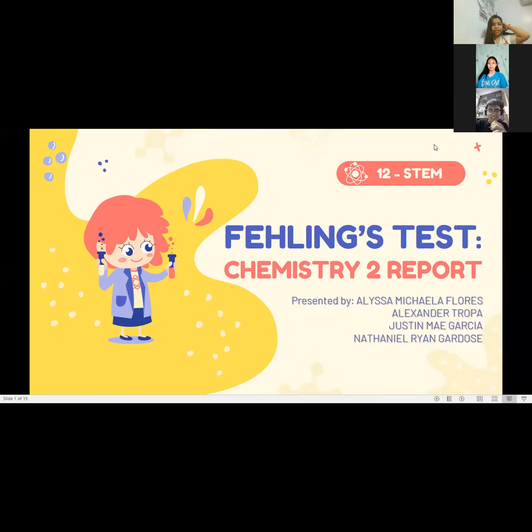The start. And go. Good day, everyone. We are the second group to conduct an experiment. The test assigned to us is the Fehling's test. For us to further understand Herman von Fehling's test, may I have Mr. Gardose and Ms. Garcia.